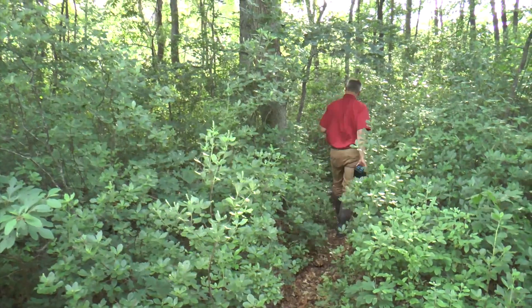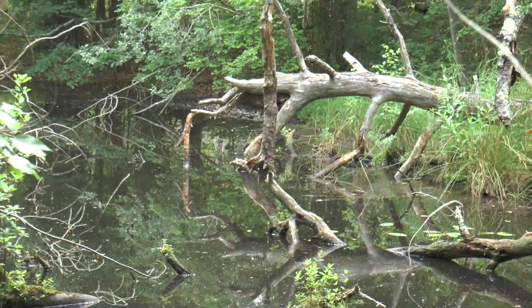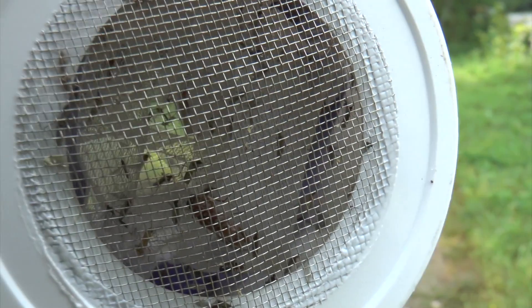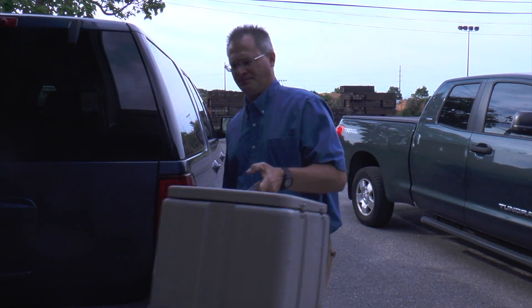In this two-part look at how mosquitoes are captured and tested for the West Nile virus, we trekked into the woods and swamps to set traps near their breeding grounds. Now that we have hundreds of mosquitoes rounded up, it's time to take the day's catch into the lab for processing. We're at our laboratory in Yapank, and this is where we'll separate the mosquitoes and get them ready for testing.